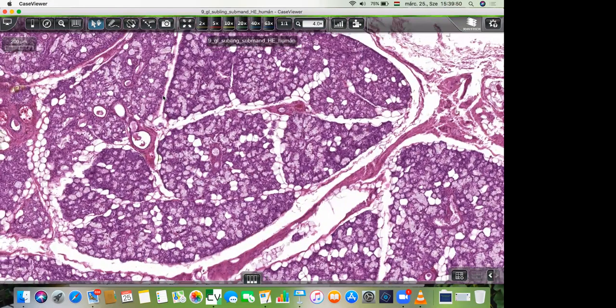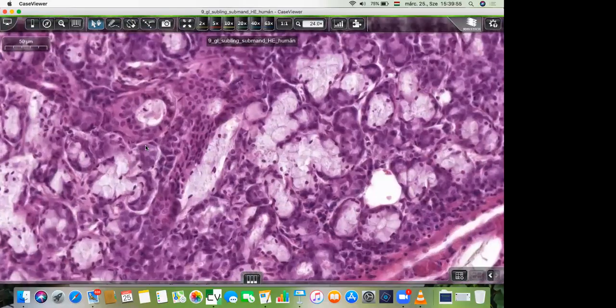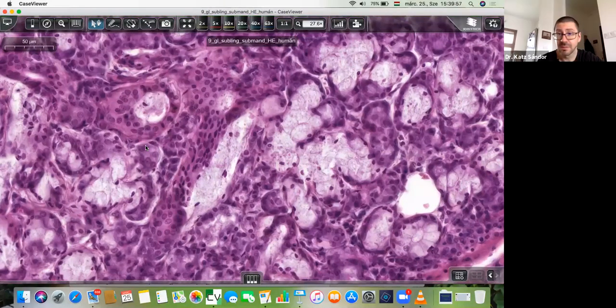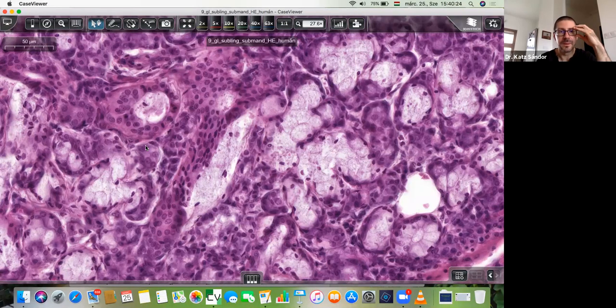Dr. Katz? Yes. So you are saying that the striated duct becomes the interlobular? Yes, yes. This is the same tube: intercalated, striated, interlobular. This is the same tube, just getting bigger and bigger, and the lining epithelium is getting thicker. So the places where we see intercalated is just at the moment, because it didn't get to the point to become the next. Ah, okay, thank you.